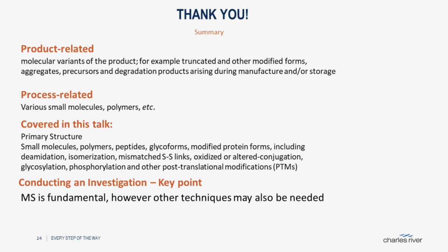And can you share any links or lists for the molecular mass change after PTMs? Oh, for various PTMs? Yes, definitely.